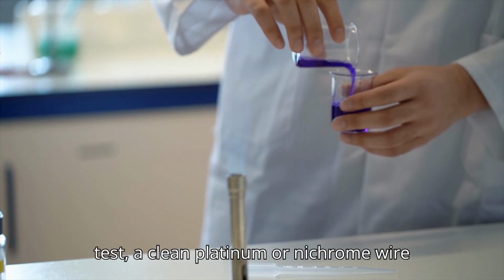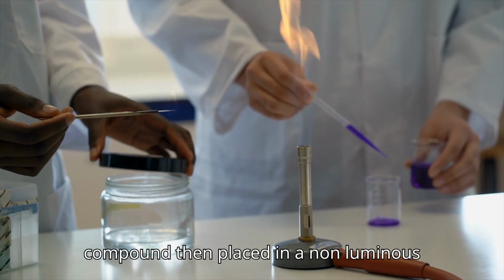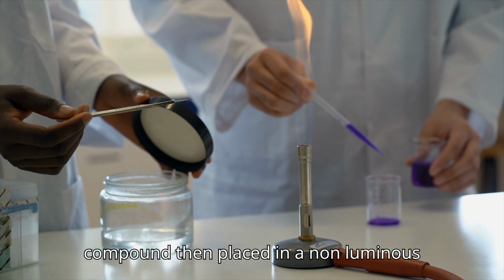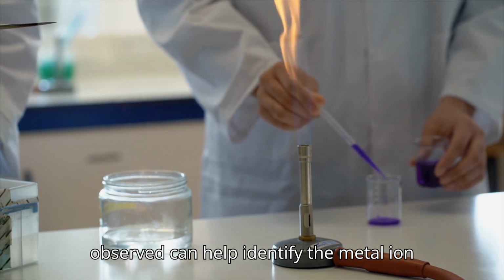To perform a flame test, a clean platinum or nichrome wire is dipped into a sample of the metal compound, then placed in a non-luminous Bunsen burner flame, and the color observed can help identify the metal ion present.